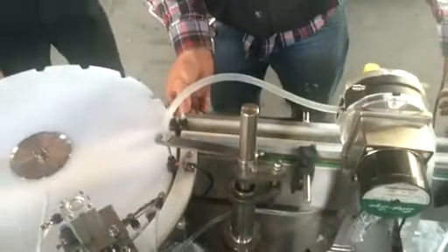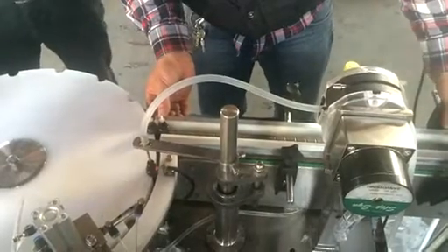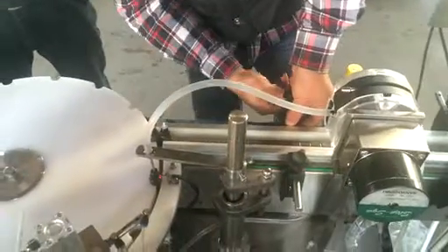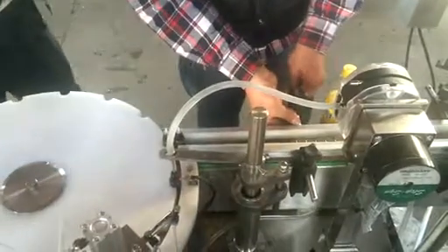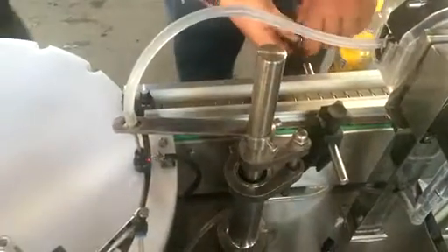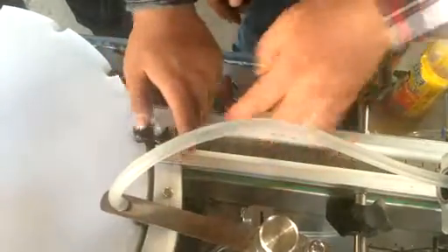Now we are adjusting the entry-conveyor, which sets the diameter for the bottle, so we can make sure the bottle doesn't fail.